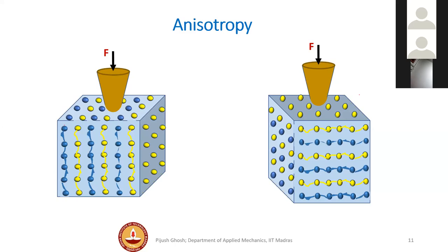Yes, just to add here, I got a similar question from Dr. Arvind Bansal. His question is: mechanical behavior during nanoindentation is facet dependent. Tableting involves compaction of a large number of particles that are randomly arranged in the tablet die. How can we derive meaningful information for tableting from a single crystal based on nanoindentation, since crystal anisotropy is common in organic crystals? Correlation between nanoindentation data and bulk tableting data remains an important challenge.